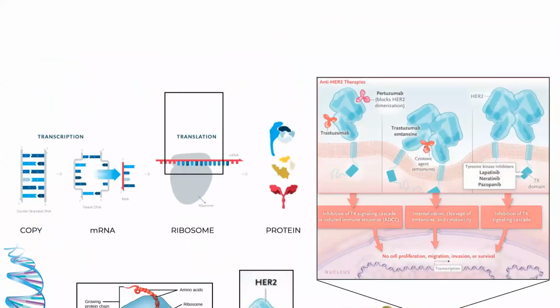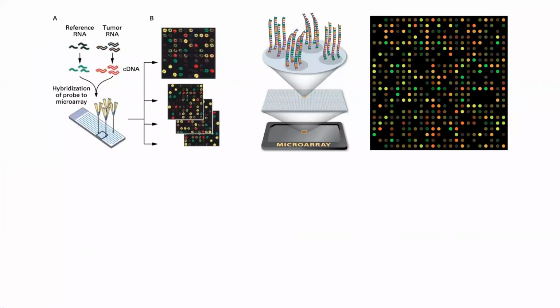So to allow us to study this kind of technology, over the past few decades, several different technologies have been designed. And RNA-seq refers to this next generation sequencing technology. So RNA-seq or RNA sequencing has revolutionized the way biologists examine transcriptomes and has been successfully applied in biological research, drug discovery, and clinical development.